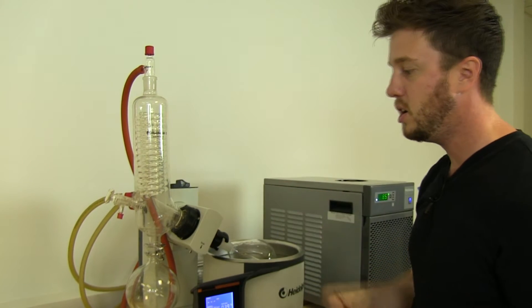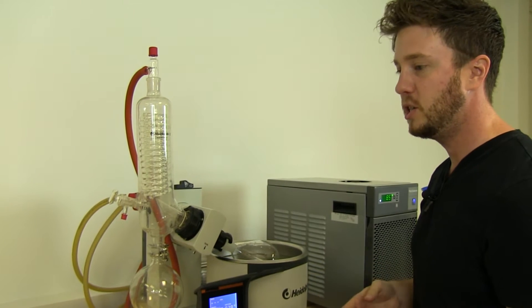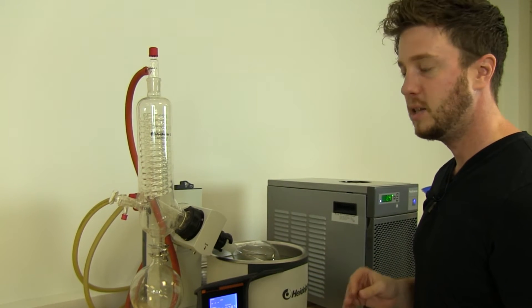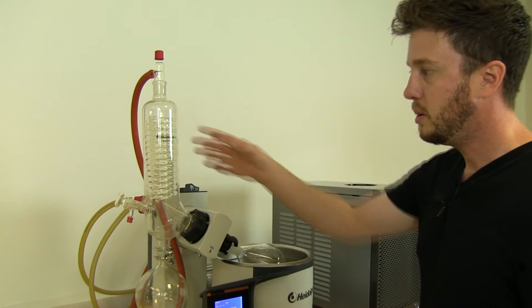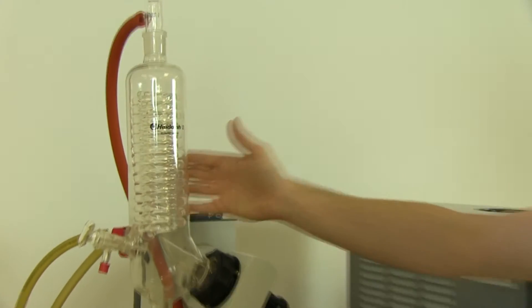It doesn't come in contact with anything in here, but should you ingest it, it's not poisonous, it's not toxic. So it circulates throughout here, chills this whole process down.